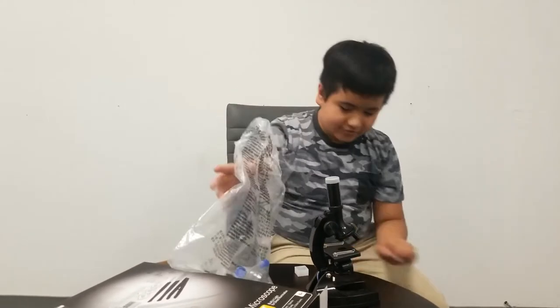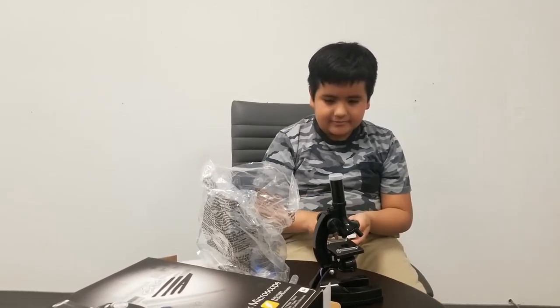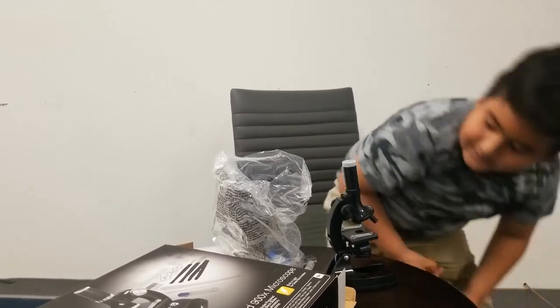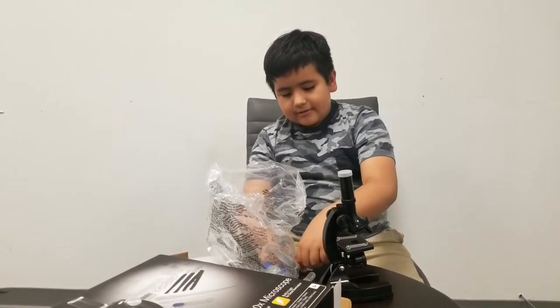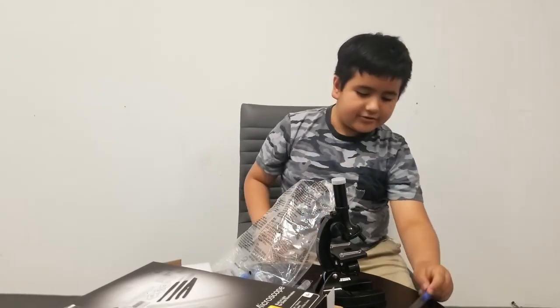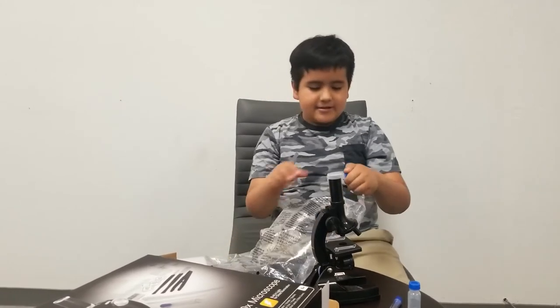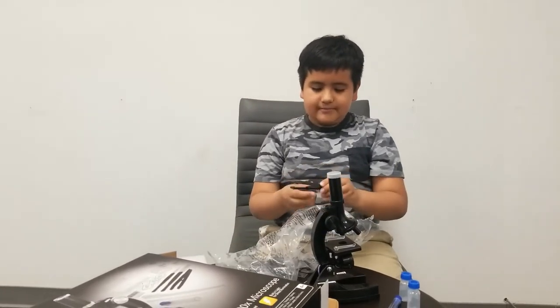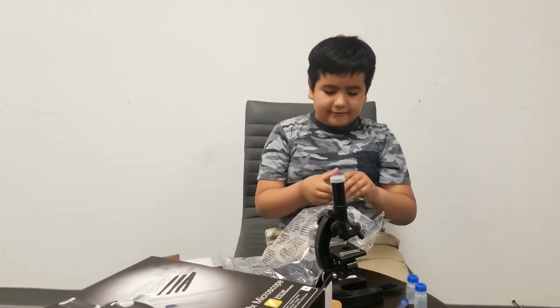I just dropped that again. So these just look like labels to label your things that you're gonna use. We have this test tube, and then we have this little container — specimen vial, it says, I think. It also says the same thing, and there are these little tweezers or whatever they're called, and we have this thing for putting stuff in, I think.